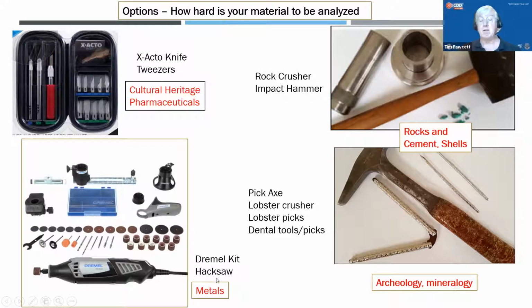A hacksaw can also be used. I've used a hacksaw to cut up pieces so I could analyze them in a diffractometer. So super hard materials. You go in an opposite direction, usually with cultural heritage or pharmaceuticals.